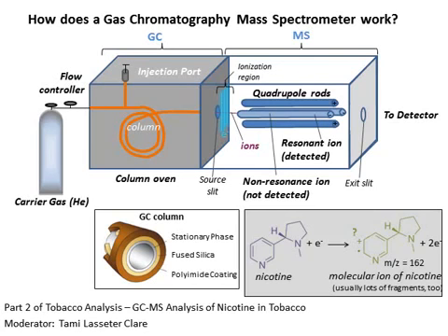The inside of the column is coated with a waxy mixture that provides a nonpolar surface for molecules to differentially interact with. But another key part to separating these molecules is the temperature of the oven, which gets ramped. And so the injection port has a high temperature of about 250 to 300 Celsius, and that is to volatilize all molecules that can be volatilized.